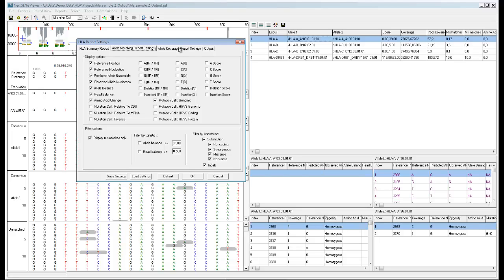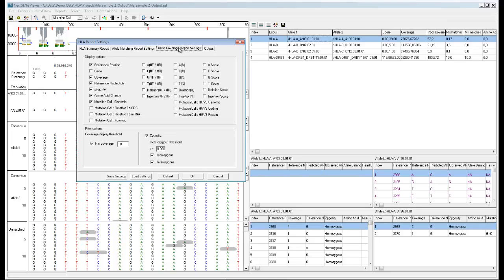On the allele coverage report settings, once again you can choose which columns to include and set filter settings. This report lists low coverage positions, so you can specify the threshold to be considered low coverage.